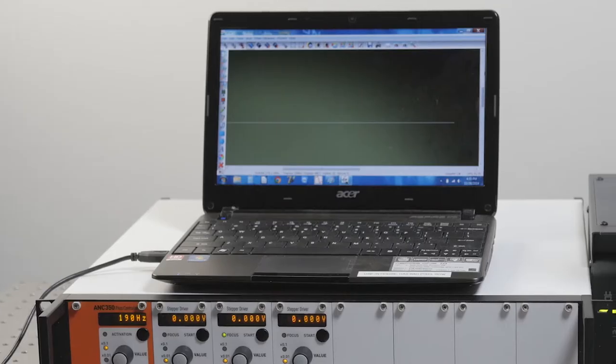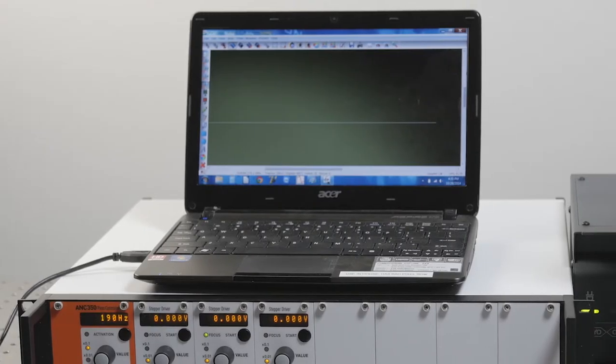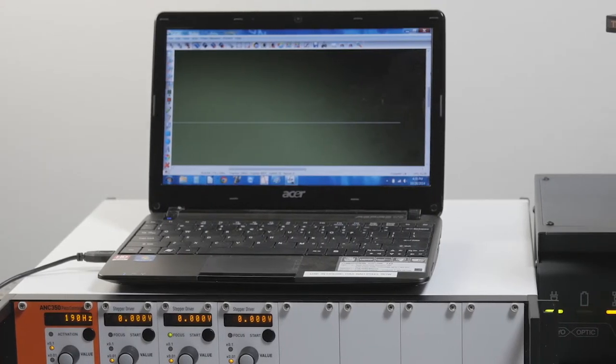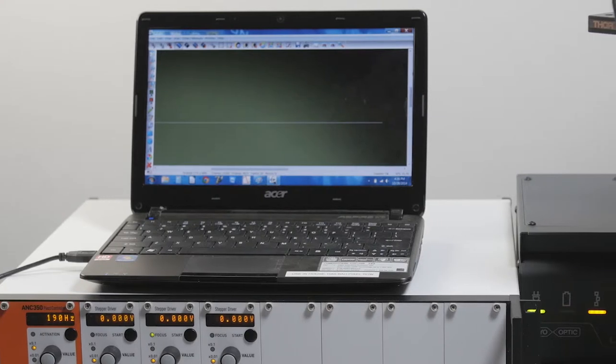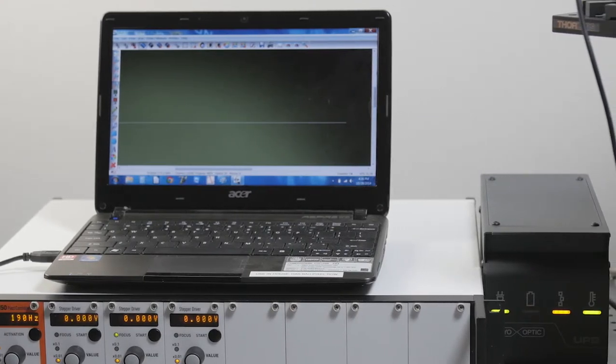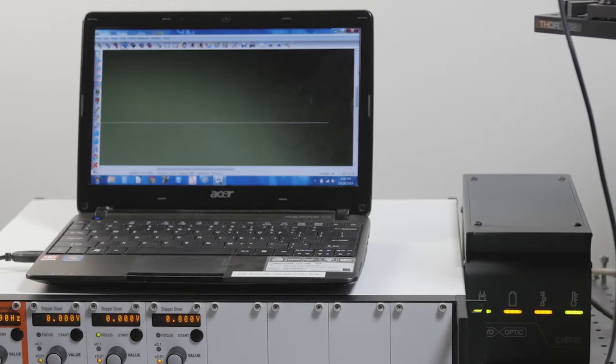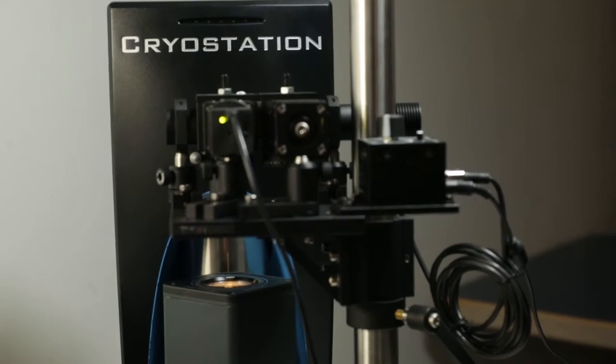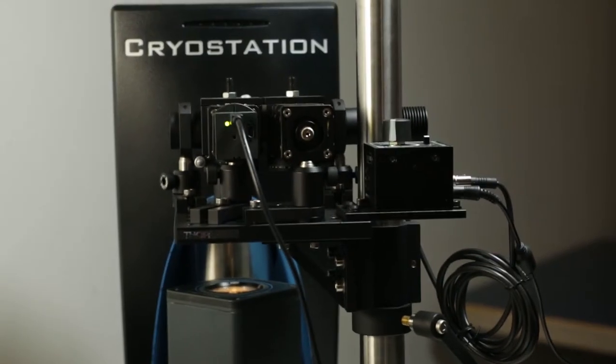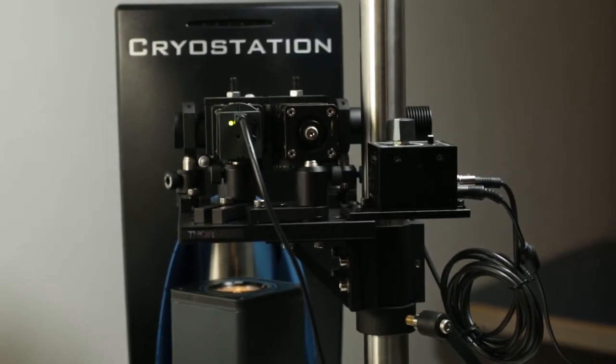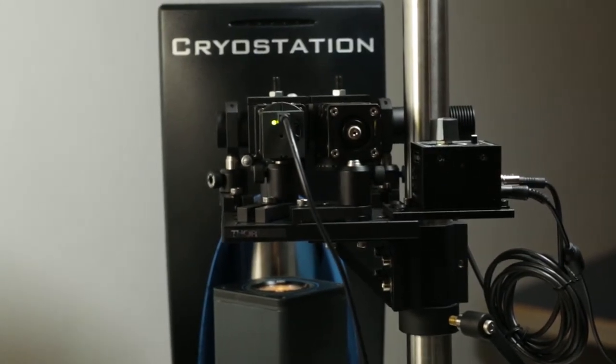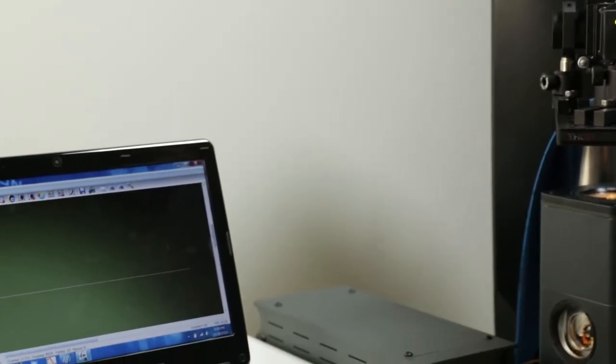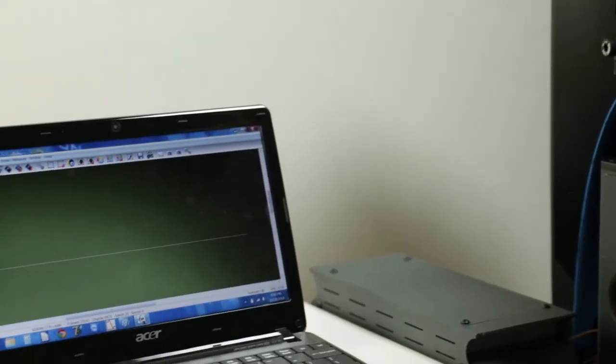Now that we've assembled the cryo-optic we're just going to image our sample which is an AFM calibration grading at room temperature before we cool down. We've introduced a simple optical setup with a white light source and a CCD camera and you'll have your own optical setup to image your sample in your space.